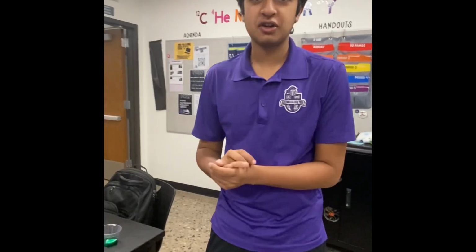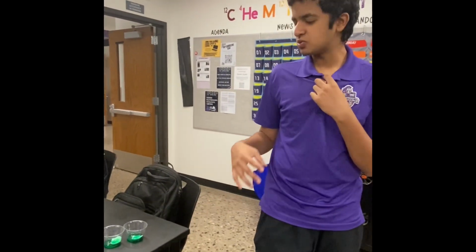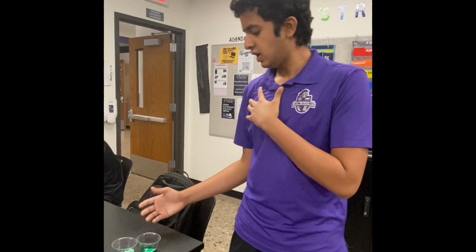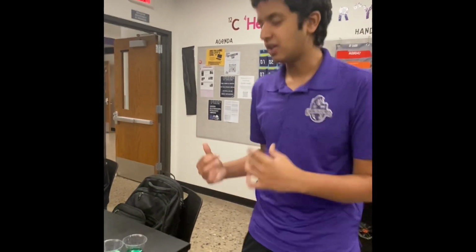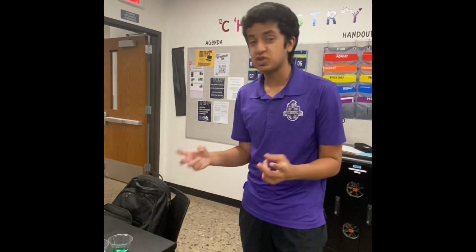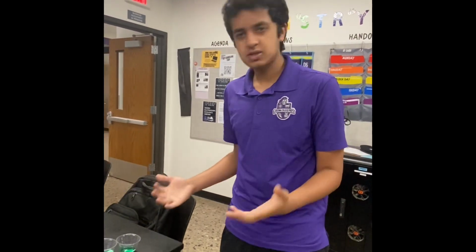The chemistry concepts covered in this easy demo that anyone can do are solution making, how to make solutions, solubility, and crystal formation, as we're demonstrating here by forming crystals out of magnesium sulfate just by using the solution and glue. Those are some of the chemistry concepts we covered. It can also relate to AP by talking about crystal lattice somewhat in ionic structures and stuff like that. So that's pretty much what we covered.